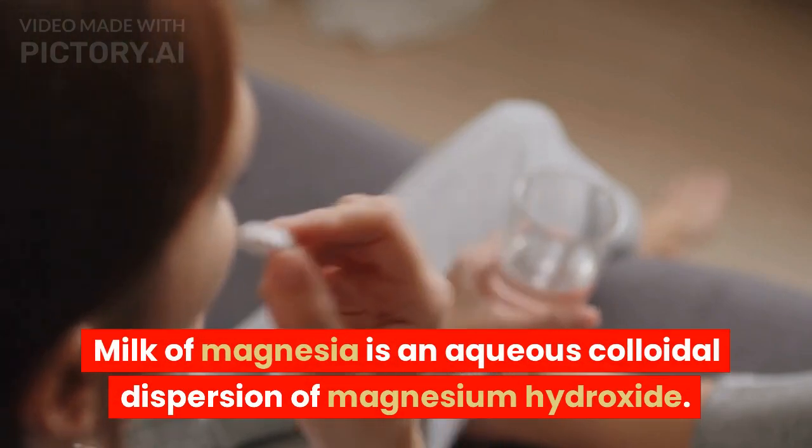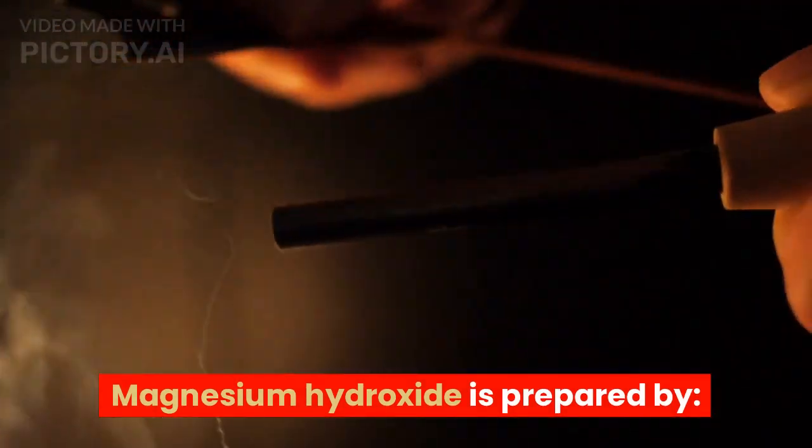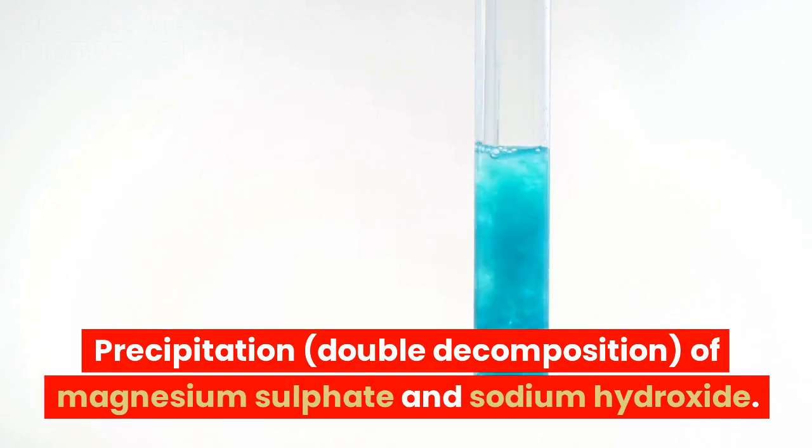Milk of magnesia is an aqueous colloidal dispersion of magnesium hydroxide. Magnesium hydroxide is prepared by hydration of magnesium oxide and precipitation — double decomposition — of magnesium sulfate and sodium hydroxide.